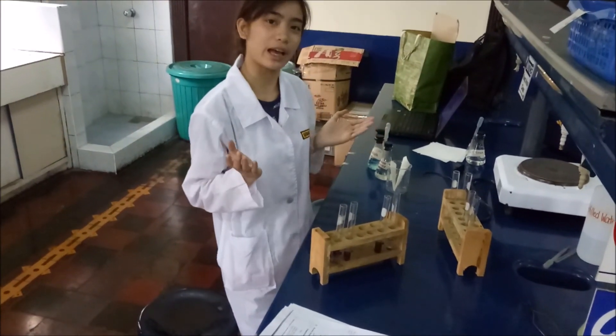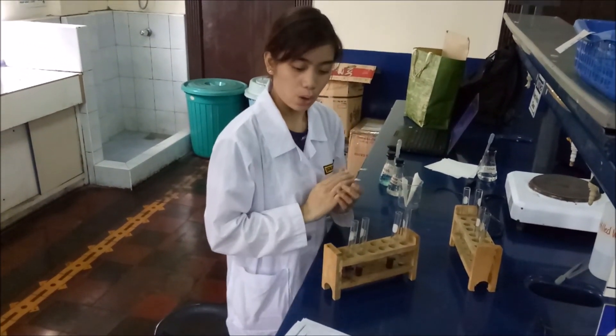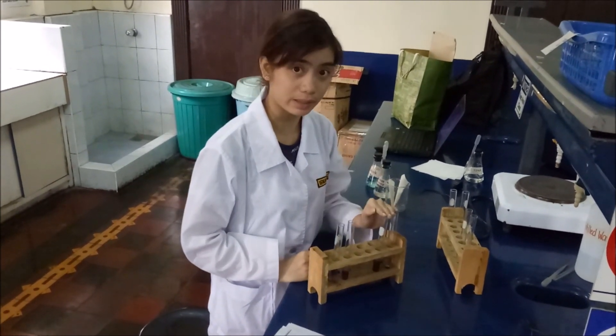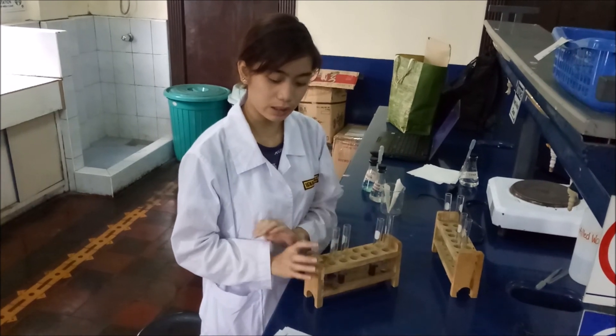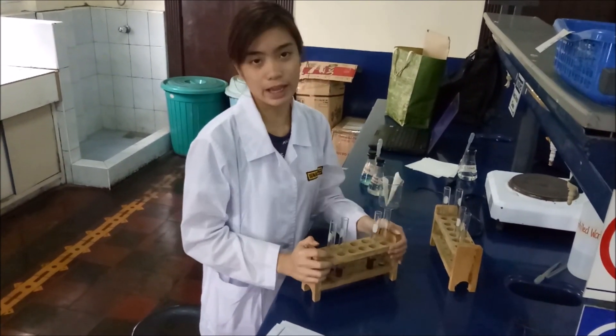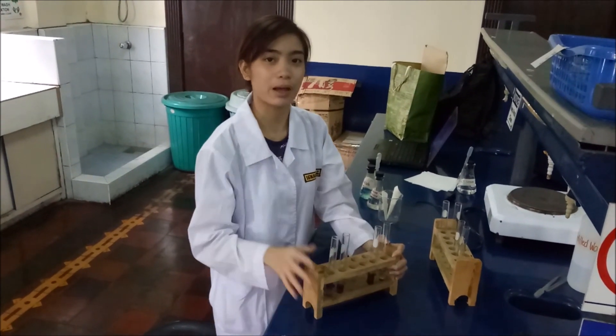So there we have it guys. We accomplished two experiments today, which are the color test for amino acids and proteins, which is the biuret test, and the protein denaturation, which is coagulation. So thank you guys for tuning in and see you again. Bye bye.